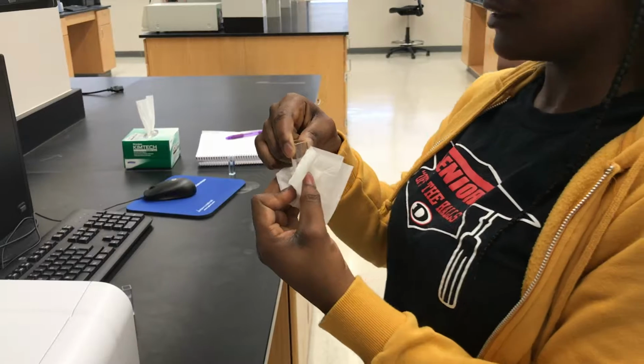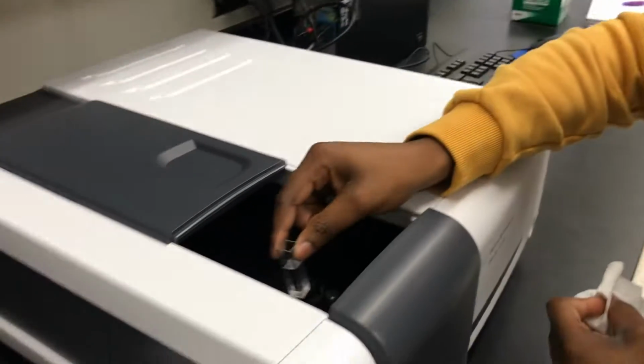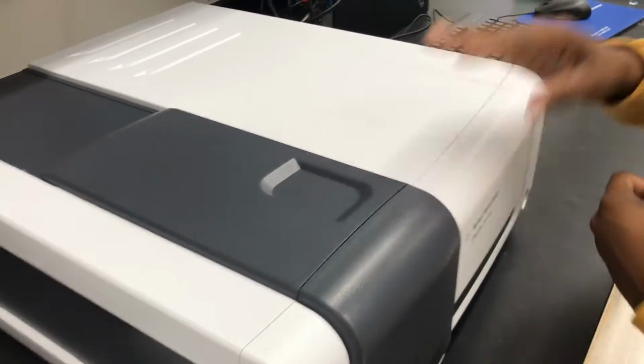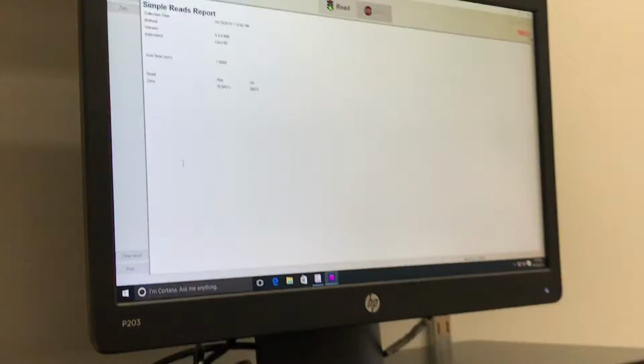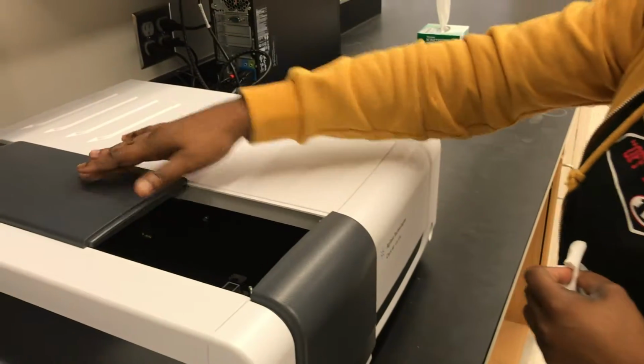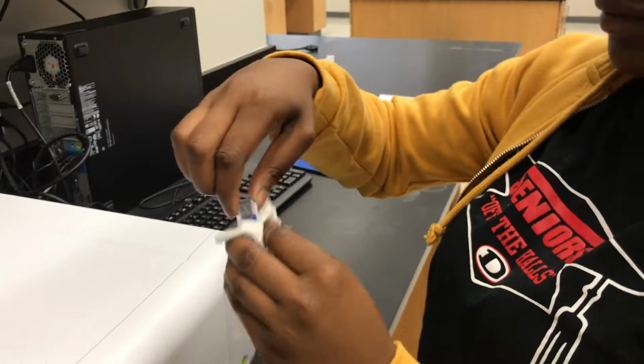First, we will take our ammonia sample, clean the sides of the cuvette, place it into the spectrophotometer, and zero it. If you do not zero the spectrophotometer using a blank, then your absorbance value will be incorrect due to the ammonia molecules being read as well.